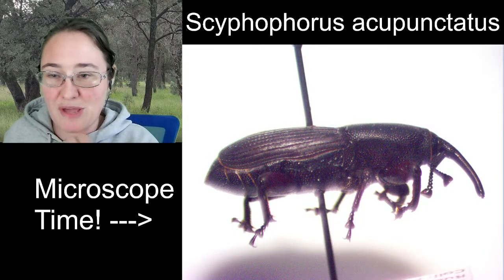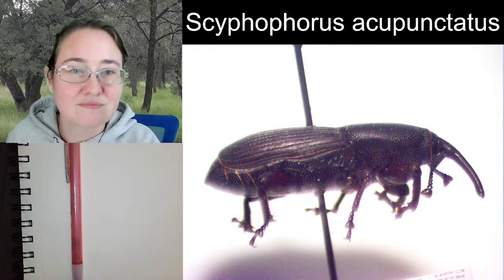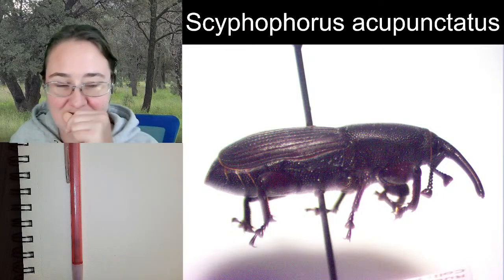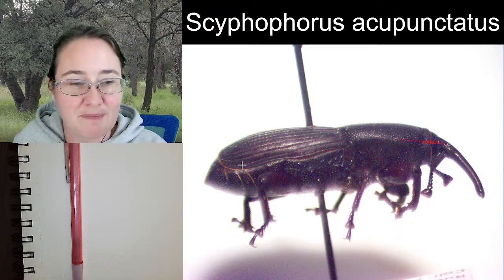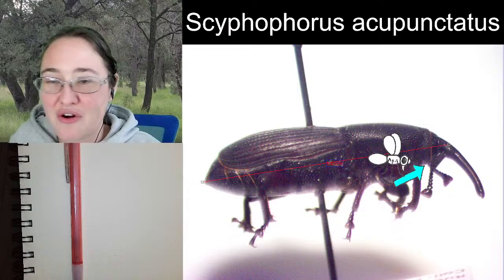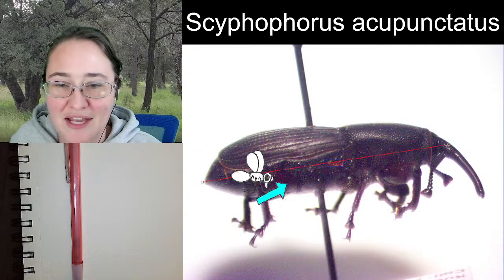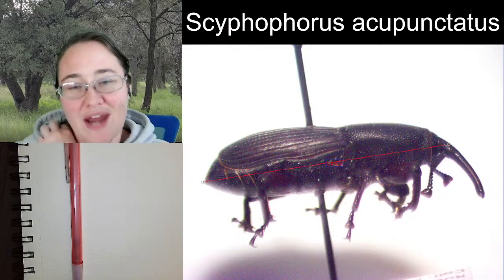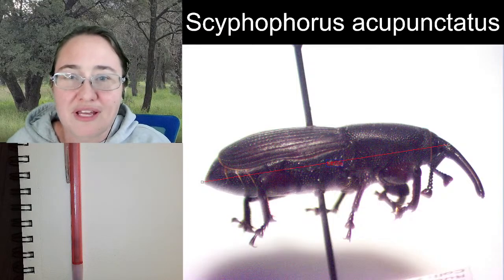So, we can actually use the microscope to measure today. Alright, so what I'm going to do is measure from the front of the head to the back of the abdomen, but I'm not adding the snout in. Do you see where that line goes? So I put right about here at the front of the head to the back of the abdomen, and then I'm going to measure the snout separately. So you can add it, but when I'm doing my first drawing, I'm going to be using kind of that space.